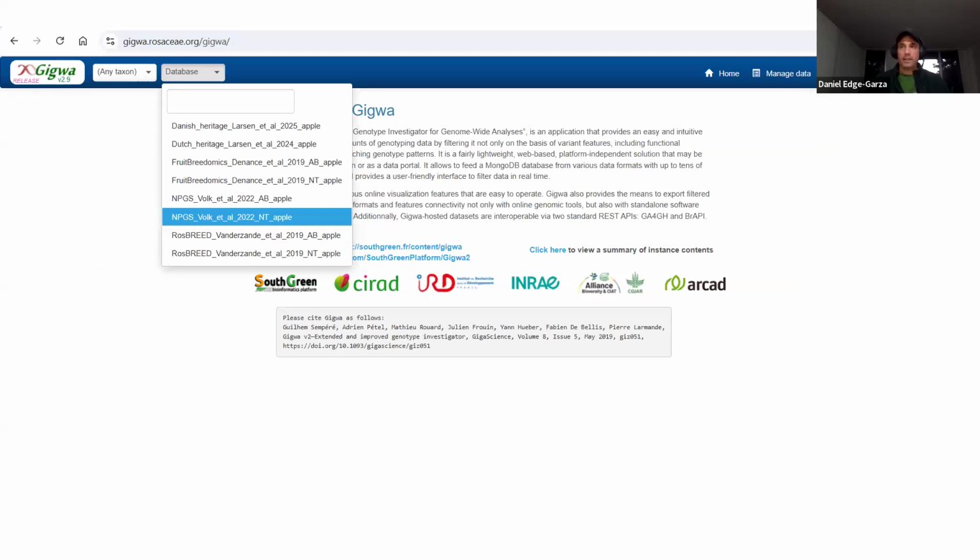So here is the home page of GIGWA before anyone logs in. These data sets that you see here in this list are publicly accessible. So you can click on database, you can access any of these data sets, you can have a look at them.